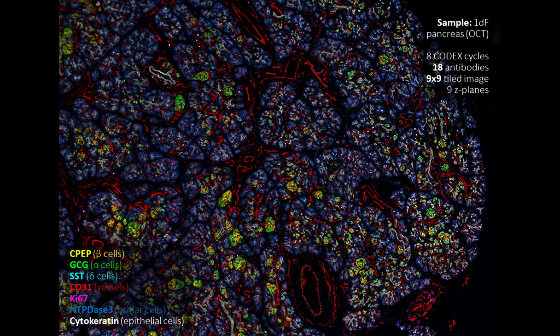But we were using 8 CODEX cycles, 6 of which had antibodies involved. The other 2 were just the DAPI for registration purposes. And then we used these 18 antibodies that I showed you a couple slides back. And this particular image came from about 9 by 9 tiles at 20x. So we took 9 Z-planes, and then the CODEX software during the processing selected the best focus plane.